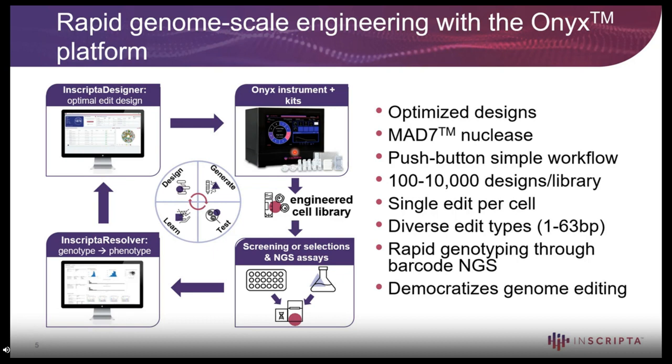And in a matter of days, 2 to 4 days, depending on which organism you're editing, out will pop this tube of edited cells, this engineered cell library. And within this tube of edited cells, each cell will have at most one of the edits that you designed within the Designer software. And there could be thousands of different edits, and I'll talk a little bit about the specs later on.